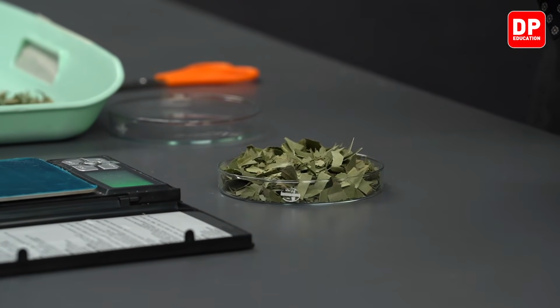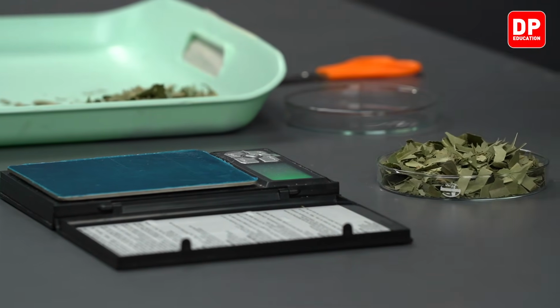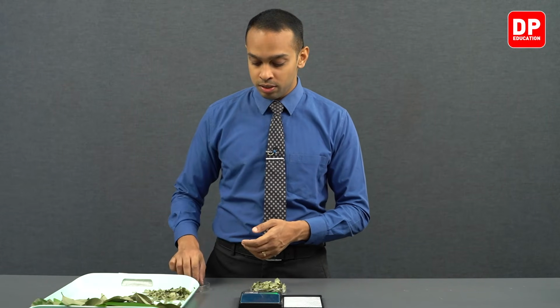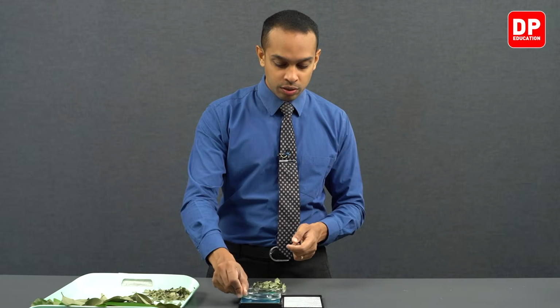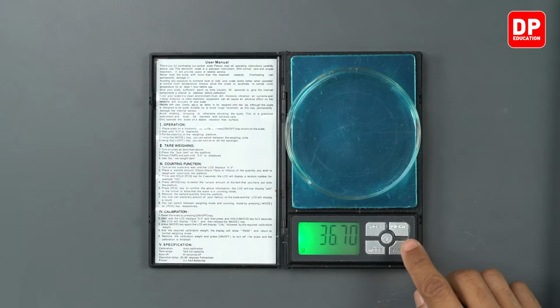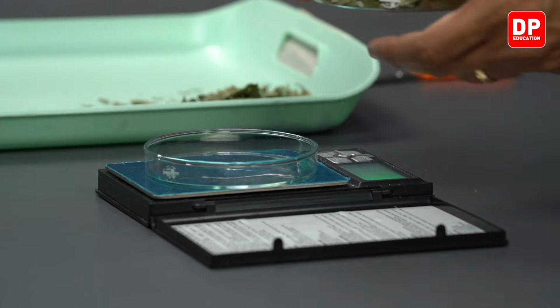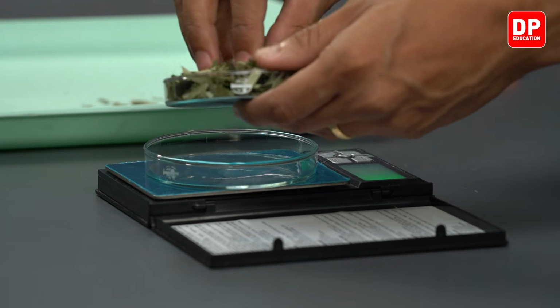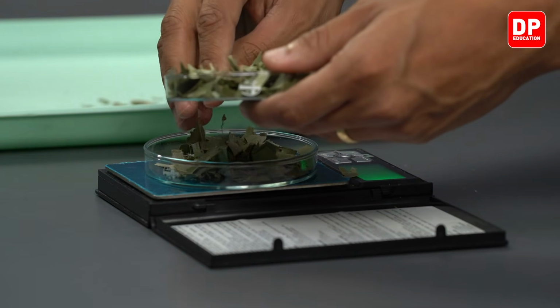And now we are going to measure 5 grams of these cut cinnamon leaves. So to measure the mass of these cut pieces of cinnamon leaves, we are going to be using a petri dish and a digital balance here. We will place the petri dish on the digital balance and use the tare function to get the reading to 0, and then we will carefully add these cut pieces of cinnamon leaves onto our petri dish.